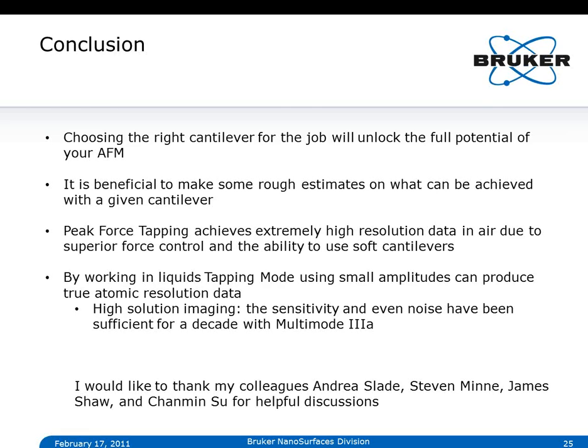In tapping mode, you do not do that. In tapping mode, first of all, you don't measure a force. You're always looking at a derivative, right? You're looking at the change of force with distance, for one. Second, you're averaging. Typically, your tapping mode signal goes into a lock-in amplifier, and out of that lock-in amplifier comes a signal, and that signal is what you use for tapping mode.